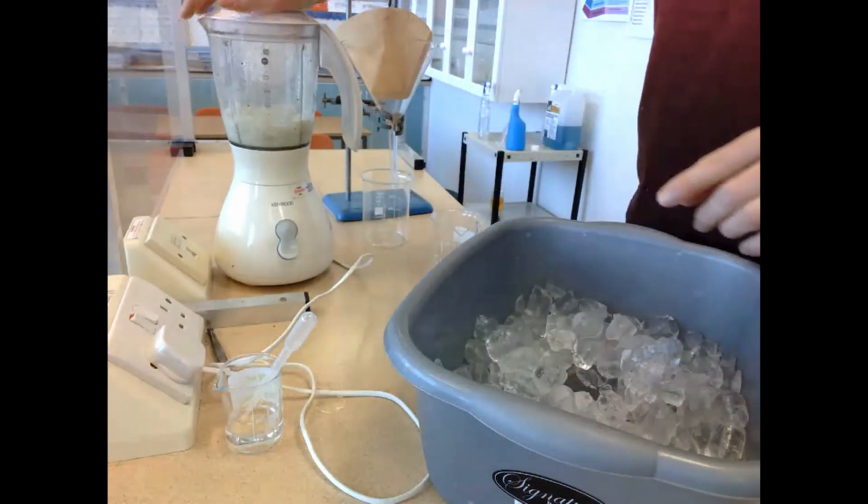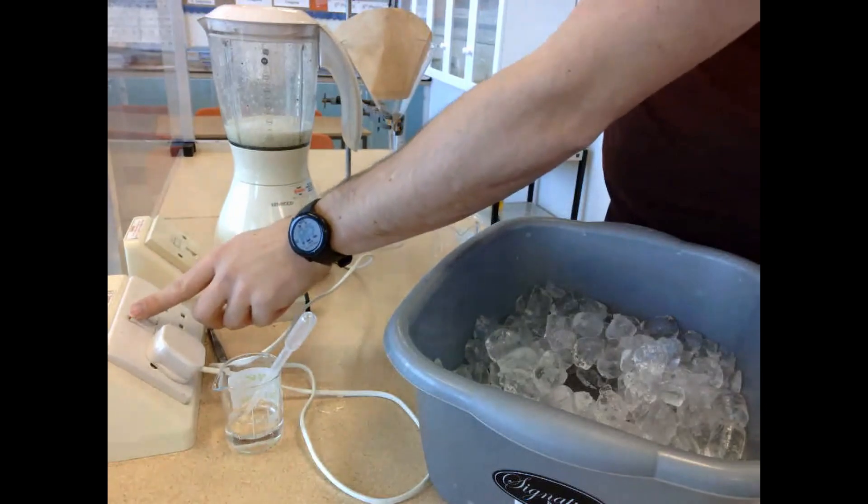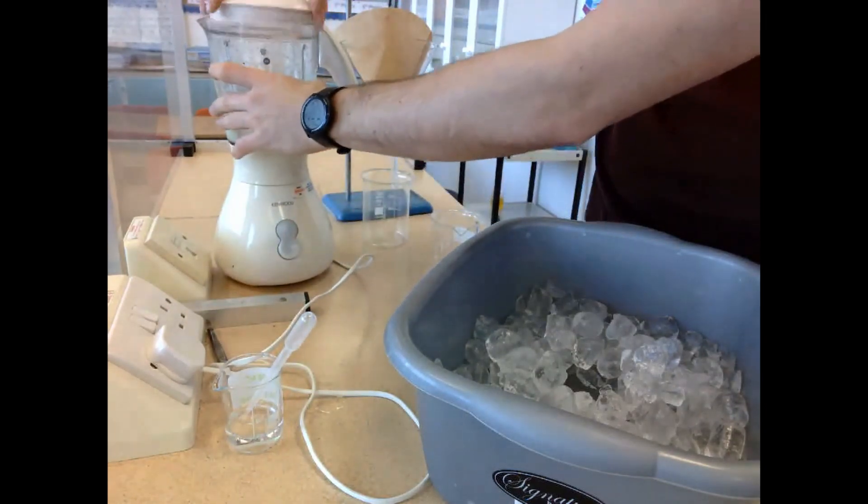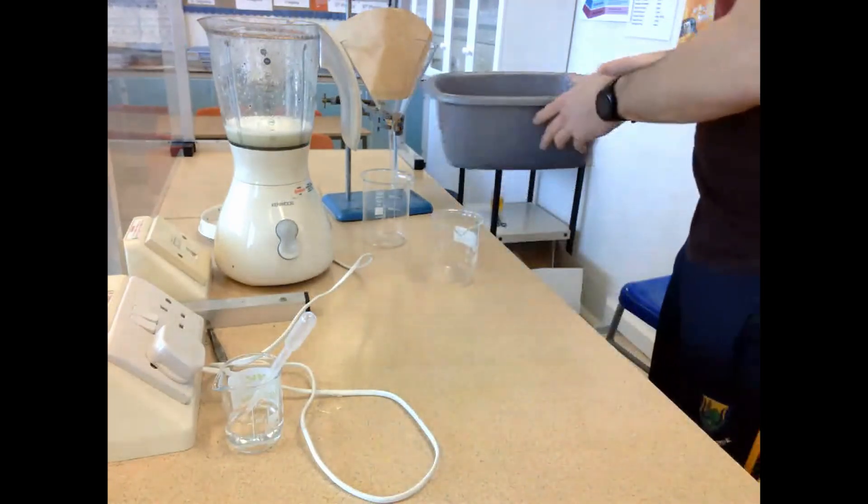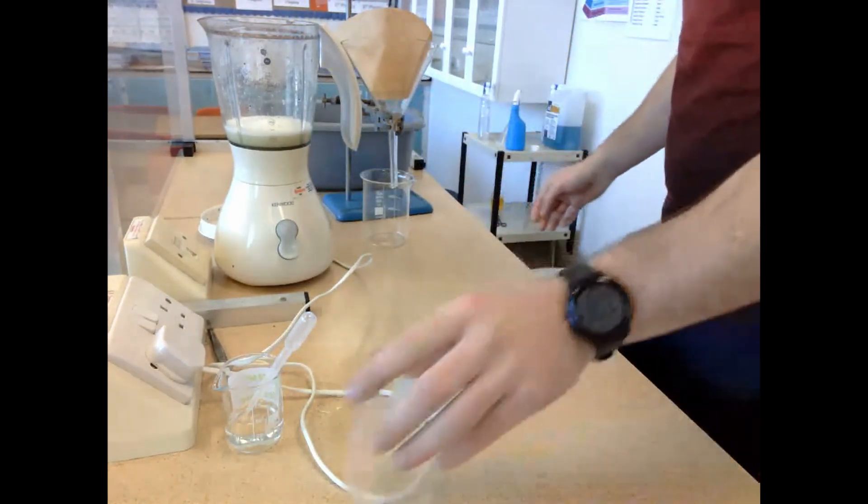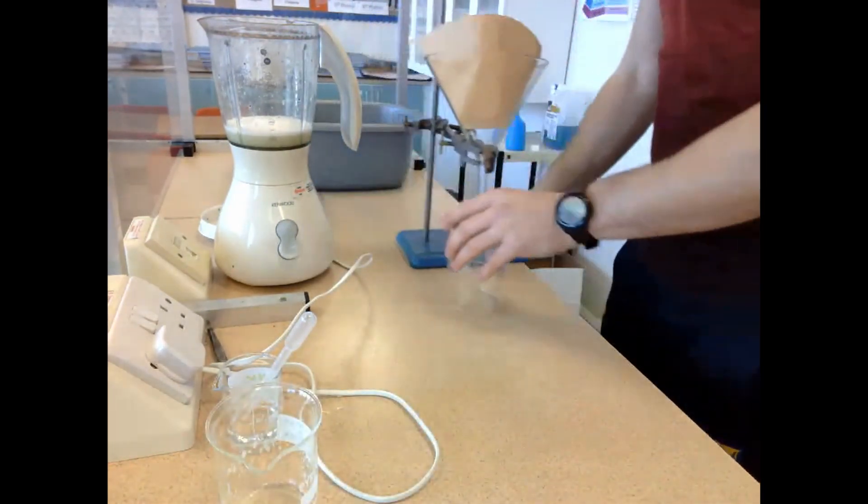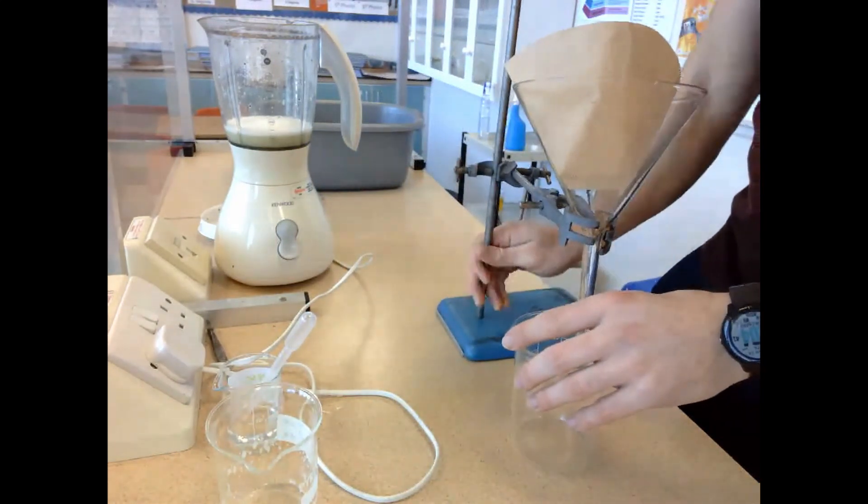And then we take it out and we begin to filter that solution. The reason we have to filter the solution is because we need to get rid of the cell debris. We don't want any of those big lumpy bits. We just want the filtrate because the filtrate is going to contain the DNA because it's really small so it can fit through the filter paper.